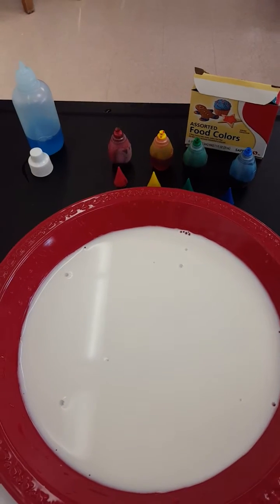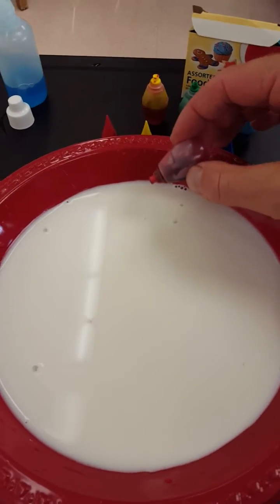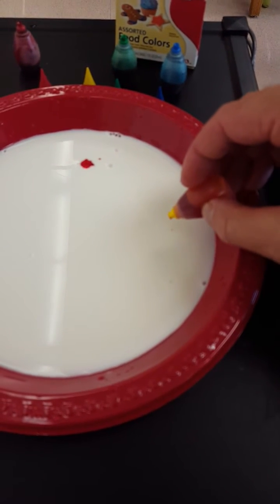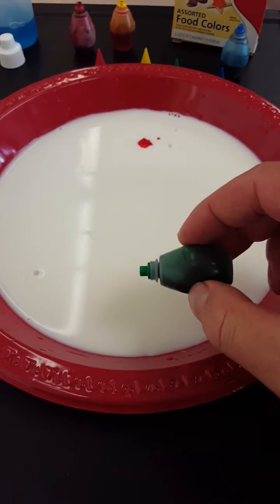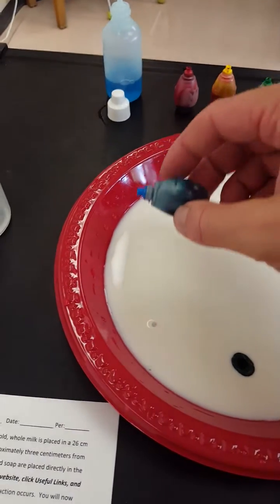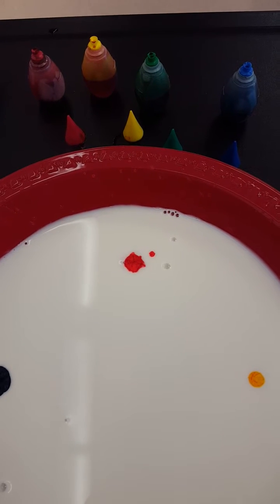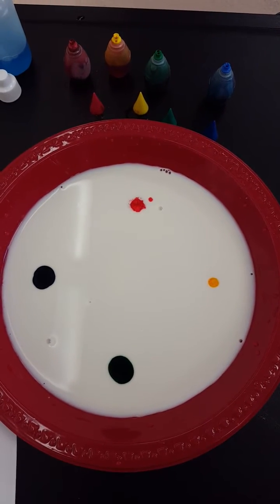I've already uncapped everything because I'm doing this with one hand. A drop of red will go at 12 o'clock, about three centimeters from the edge — right about there. Then a drop of yellow at 3 o'clock, right about there. Drop of green at 6 o'clock, and then a drop of blue at 9 o'clock. I do have a slight error — apparently a little extra red dripped in there. Oh well, I'll just go with it. So there's our food coloring: red, yellow, green, blue.